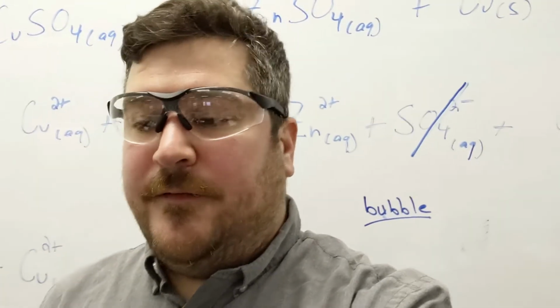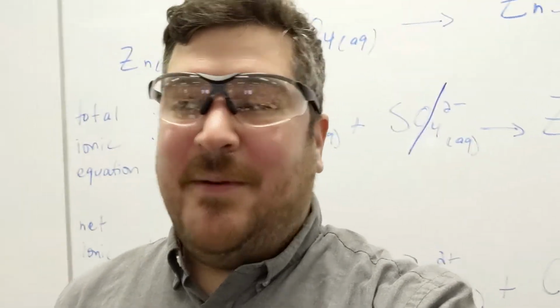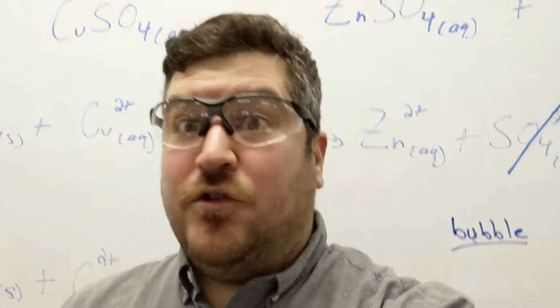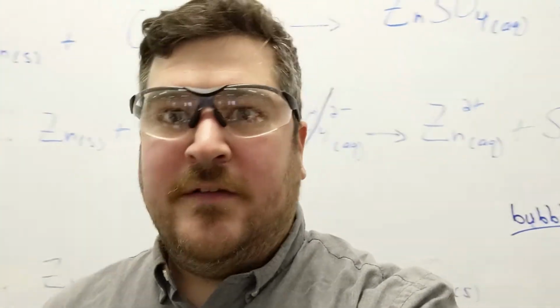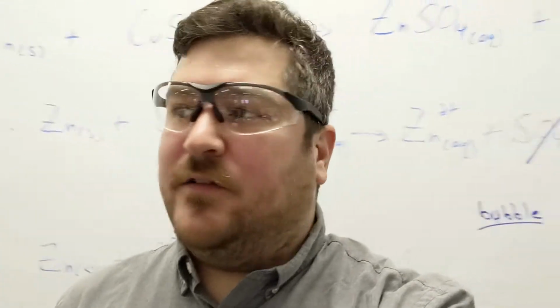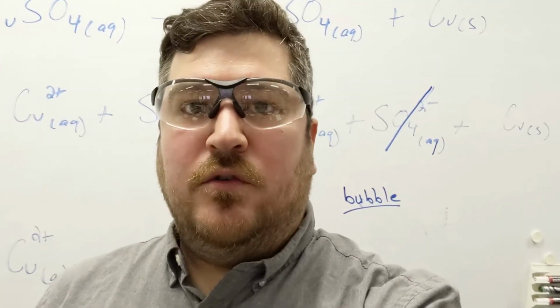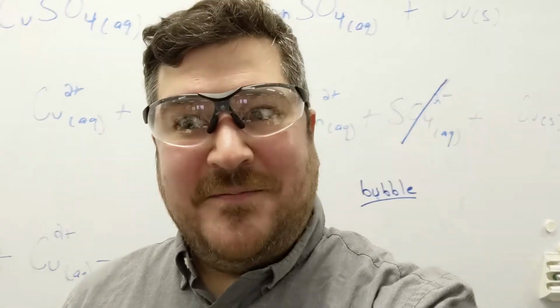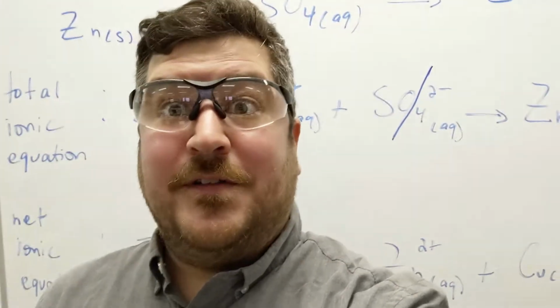I'm just in here filming for your sixth lab. As you know, we had some students with issues. They had to quarantine for a few weeks. I think it was almost half the class. So we decided to do the labs online, so most of you wouldn't get to miss it. So here it is, lab number 6.